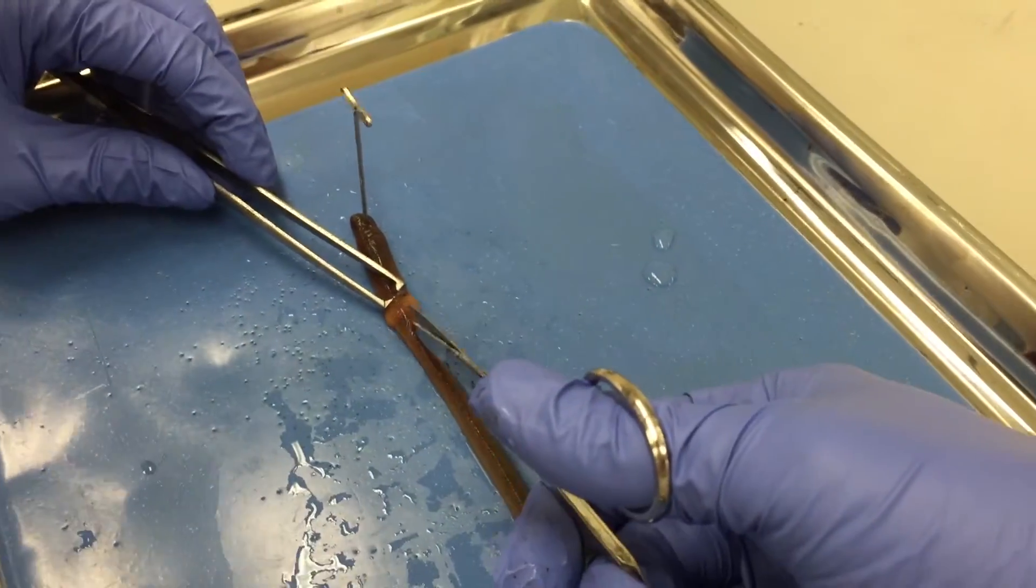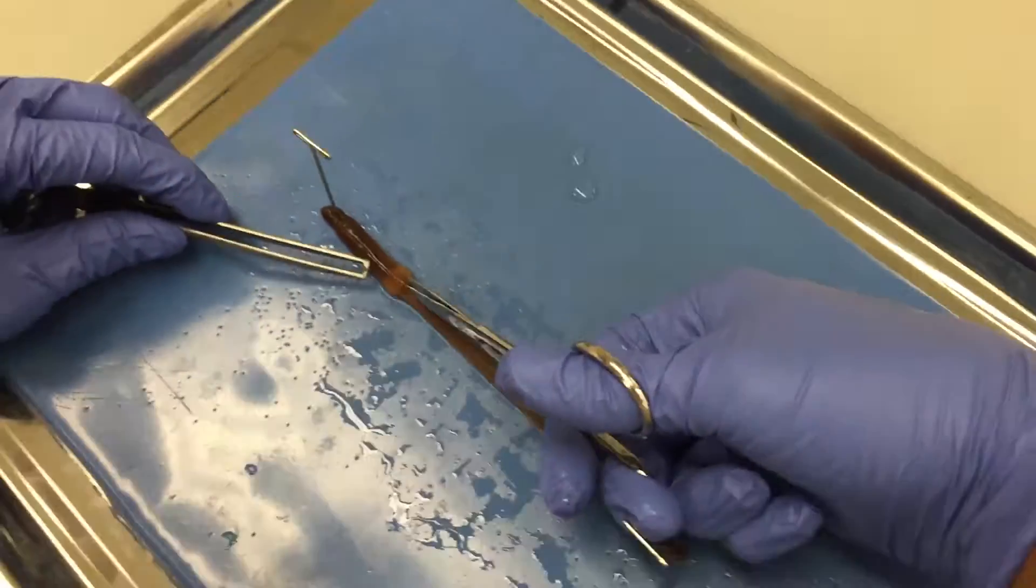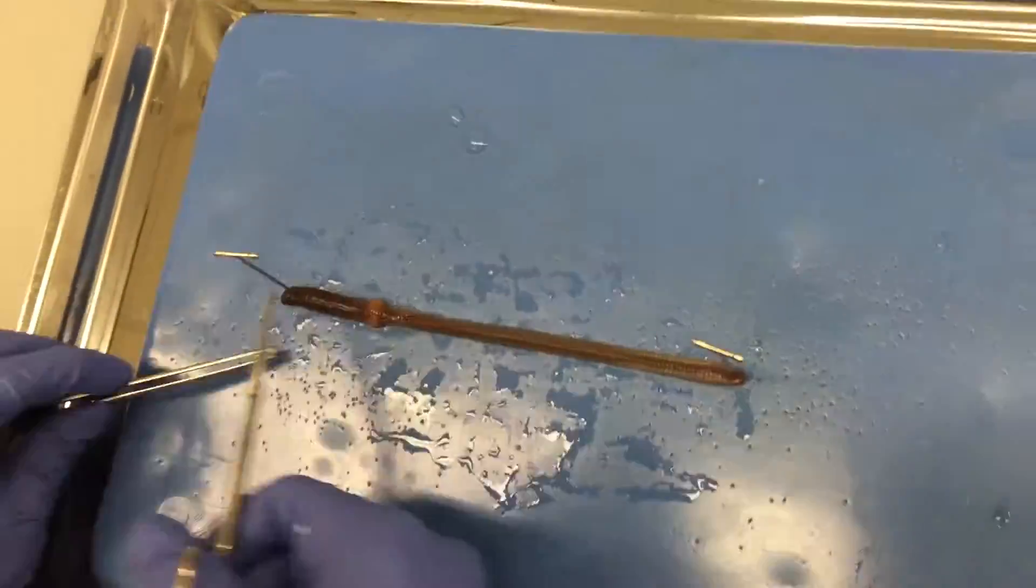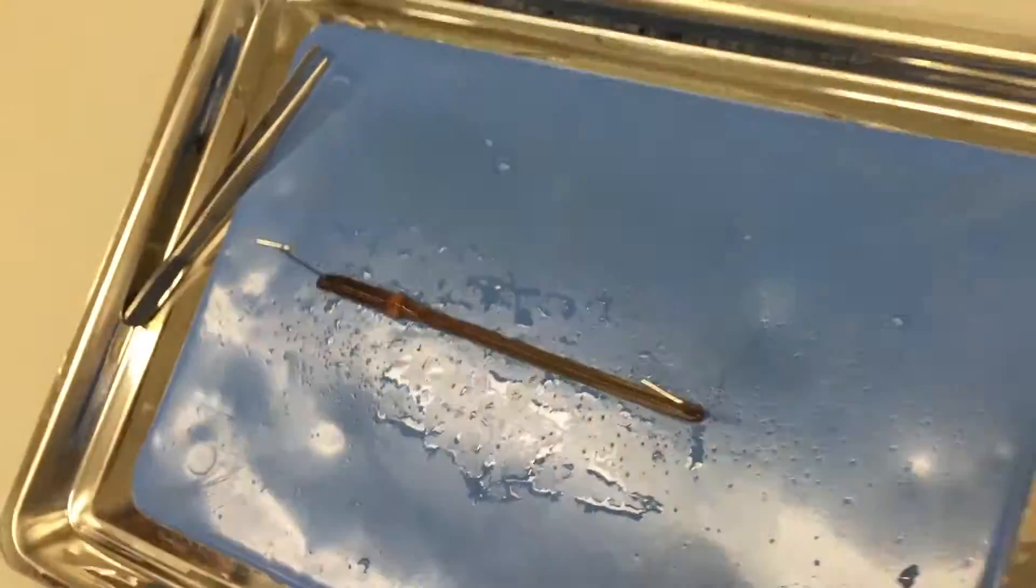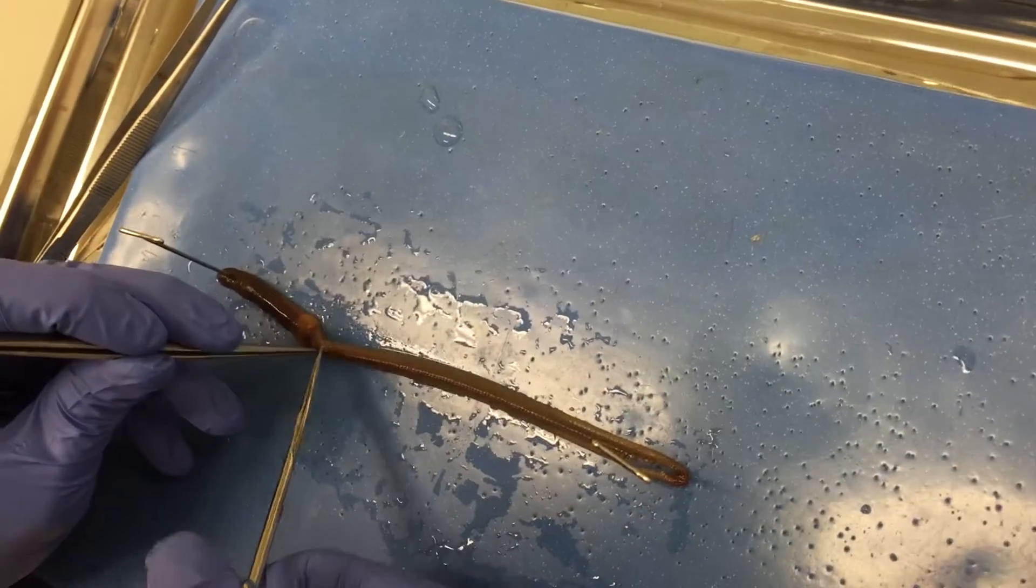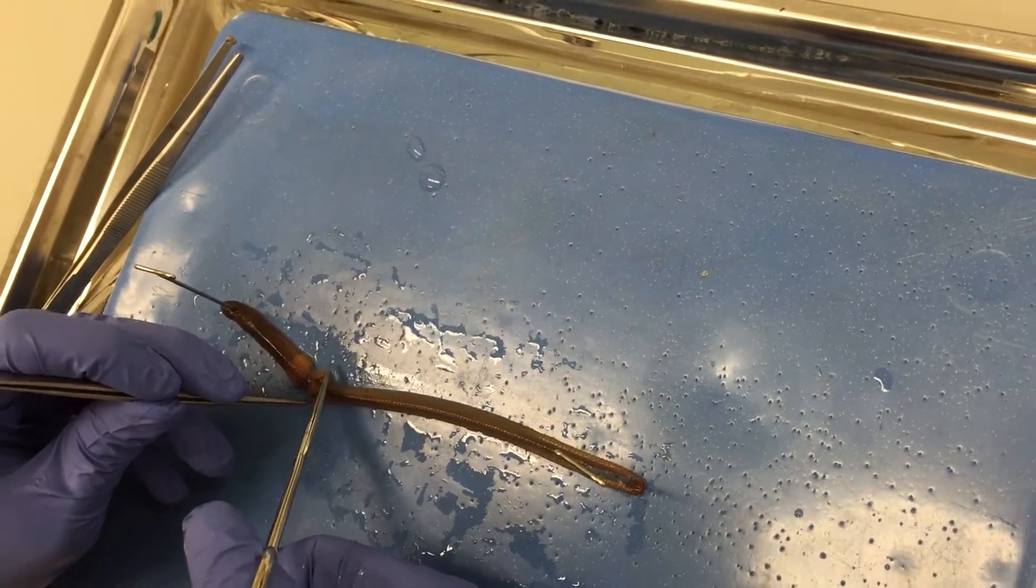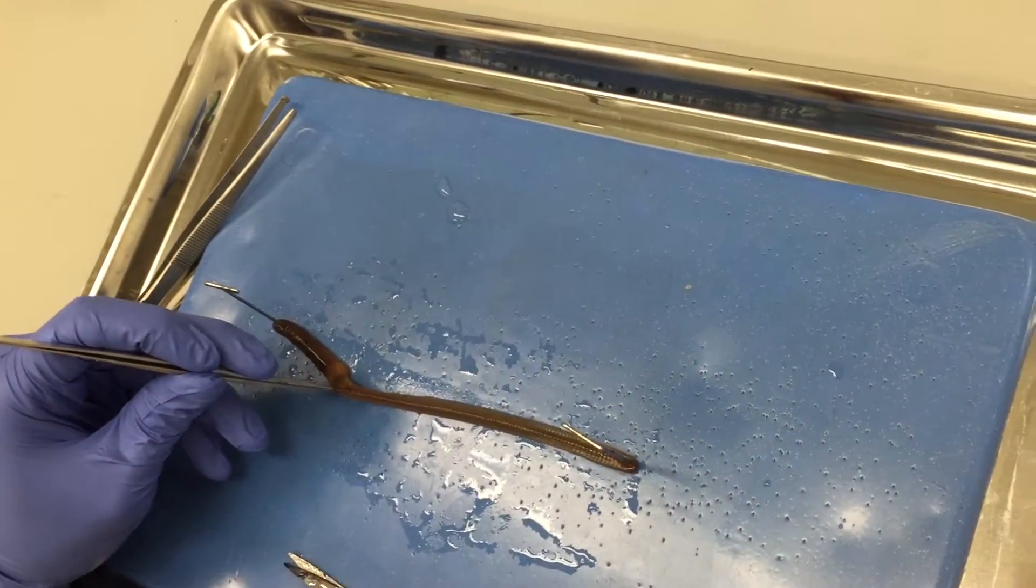Using the scissors, carefully cut down the worm's skin towards and past the clitellum, exposing the internal organs of the worm. You will have to cut away the septum and other connective tissues or structures to effectively open up the worm.